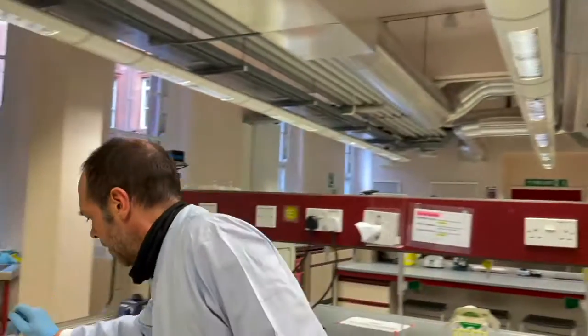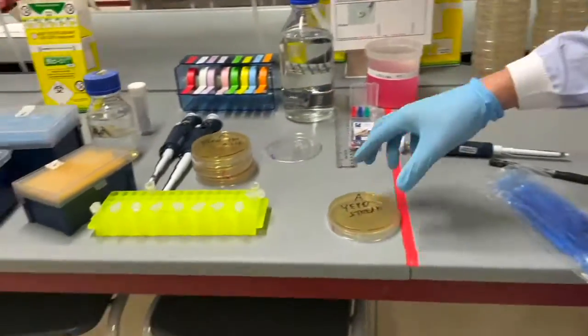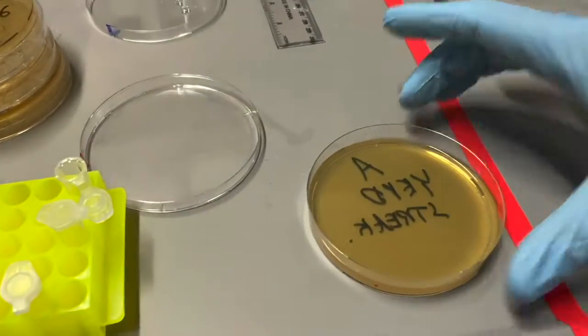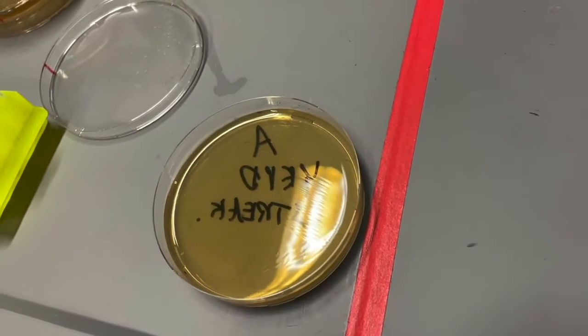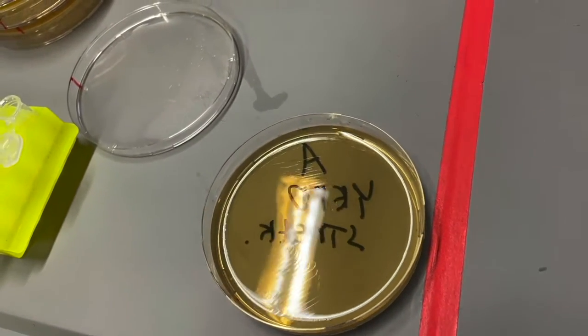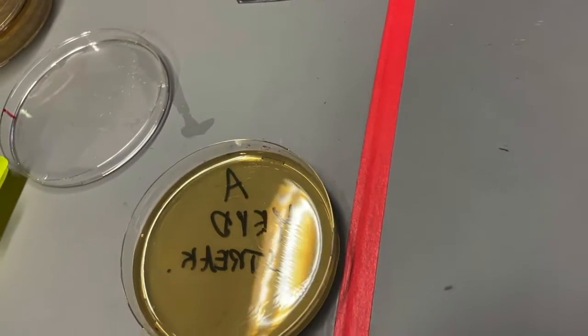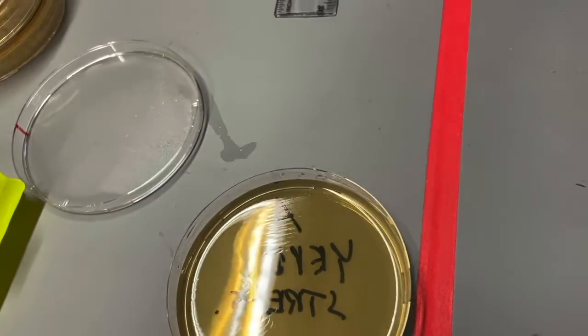Throw that away. Can we just do a close-up of the plate? It's hard for us to see in the video where I went. Okay, if you get the angle right, you can probably see the impression. If you look in the part where the light is reflecting, you can see Duncan's streaking. Unfortunately, we can't see the whole plate at once. It's a bit easier when you personally are holding the plate to see this.